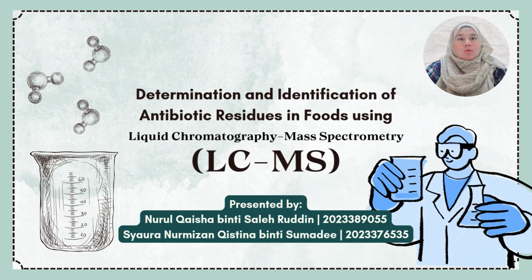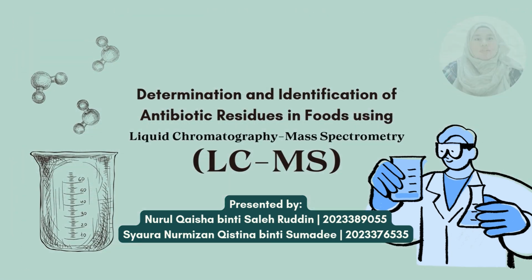In this video, we'll be demonstrating the determination and identification of antibiotic residue in food using liquid chromatography mass spectrometry, LCMS. This analysis was focusing on food, particularly fruit from different types.